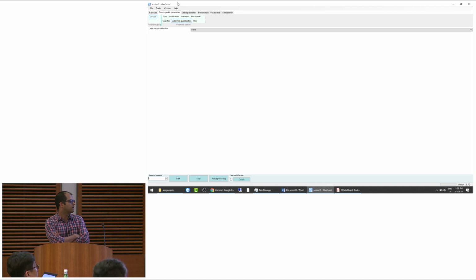I have a question about occupancy calculation. So, for instance, of course, we have to have the proteome file and the phosphorylation files or phosphoproteome files. So, let's assume that we have a very short time frame phosphoproteomic study, and we have multiple time points for phosphoproteome, but we do not have as many time points for proteome. Because for phosphorylation, we are also measuring at minute or seconds level. So is it possible to calculate the occupancy, or we always have to have for every single time point all these phosphoproteome and proteome files?